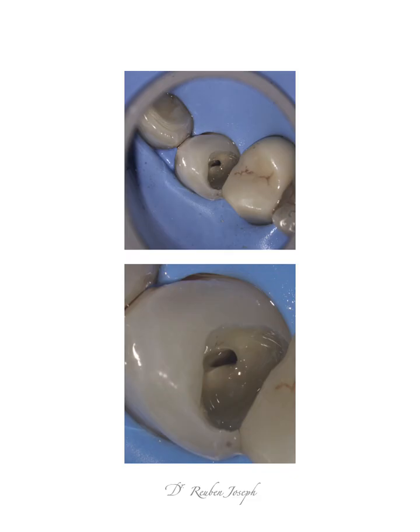So the rule is very simple. If you have a good documentation setup, go for it, crop as much as possible, get it as close as possible to the area of interest. But if it is not that great, if you're going to crop and get too close to what you want to show, you will end up exposing the fact that it is a low quality image.